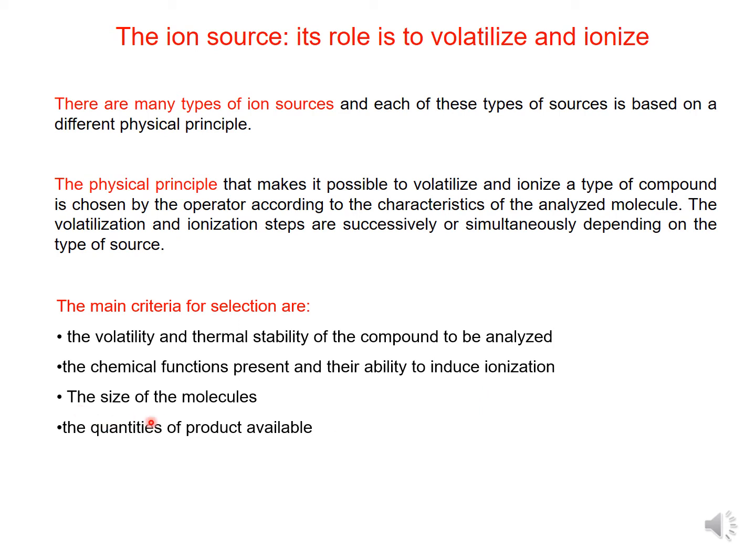The size of the molecule, because sometimes this is different in terms of ionization or volatility. The size is a very important property. And also the quantity of product available, depending on if you work in trace or if you work in a high concentration.